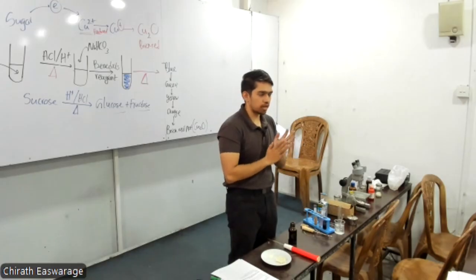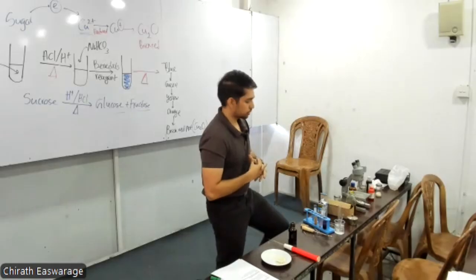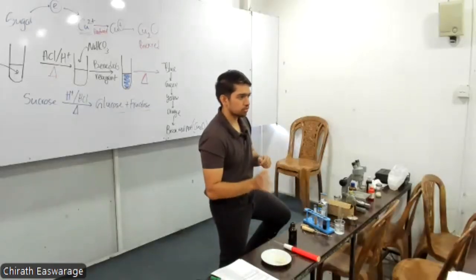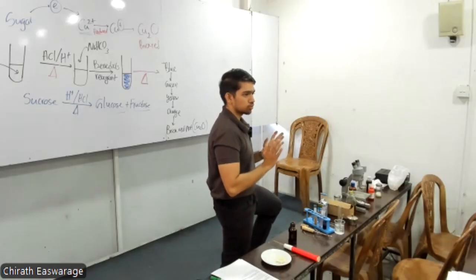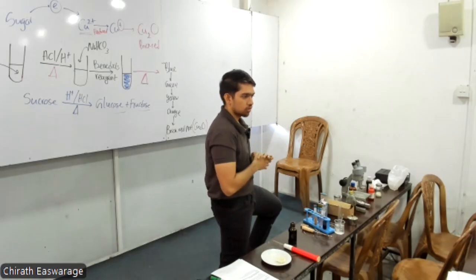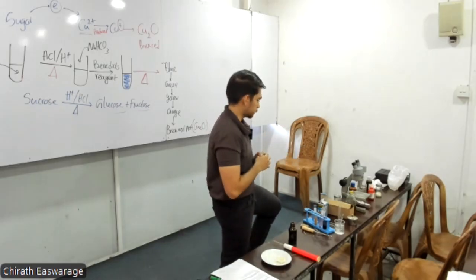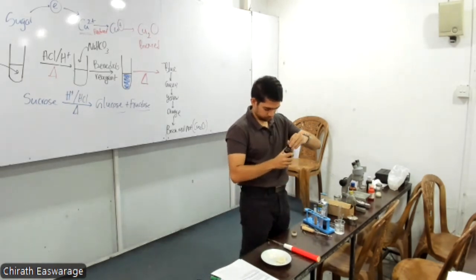Maybe next month. My plan is to come to about cell division by the end of next month. September, October, let's finish the chemical and cellular basis, right? Otherwise, because we started this in August, we are lagging behind. Okay. Let's add iodine to the bread too.